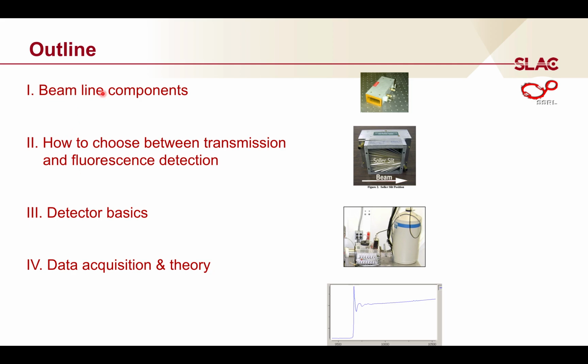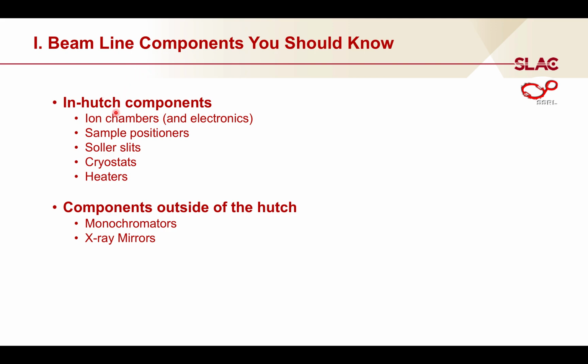So I'm going to jump right into beamline components to get going here. This section is really an introduction to beamline components, but I'm going to go fairly deep on some of the topics for those of you who already have some experience using this hardware. It'll help to explain why we use it and how you can optimize it.